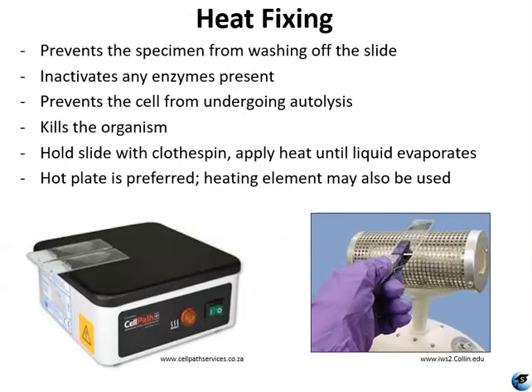After a smear is prepared, most stains require the cells to be heat fixed. Heat fixing prevents the specimen from washing off the slide during the stain procedure. It also inactivates any enzymes present. It prevents the cells from undergoing autolysis. It also kills the organism.